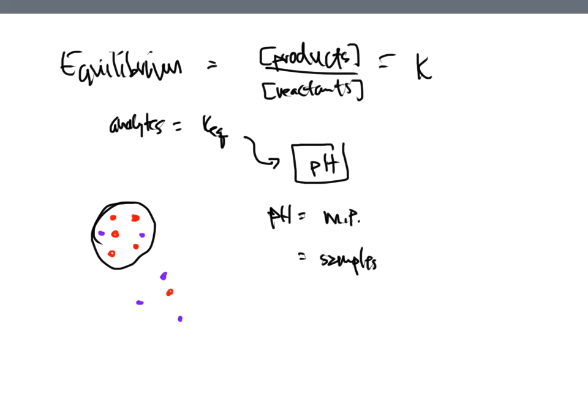Okay? Something else that we want to talk about is that the capacity of your home is going to be a little bit different depending on what size home that you have, right? So we now want to bring in this concept of capacity. So all columns have capacity, and different columns will have different capacities. So for instance, you have a house or you have an apartment that you're living in, and that has a certain capacity. You might have one bedroom, you might have two bedrooms, you might have five bedrooms. Who knows what you've got? But you will have a specific capacity of how many people can spend the night with you at one time.